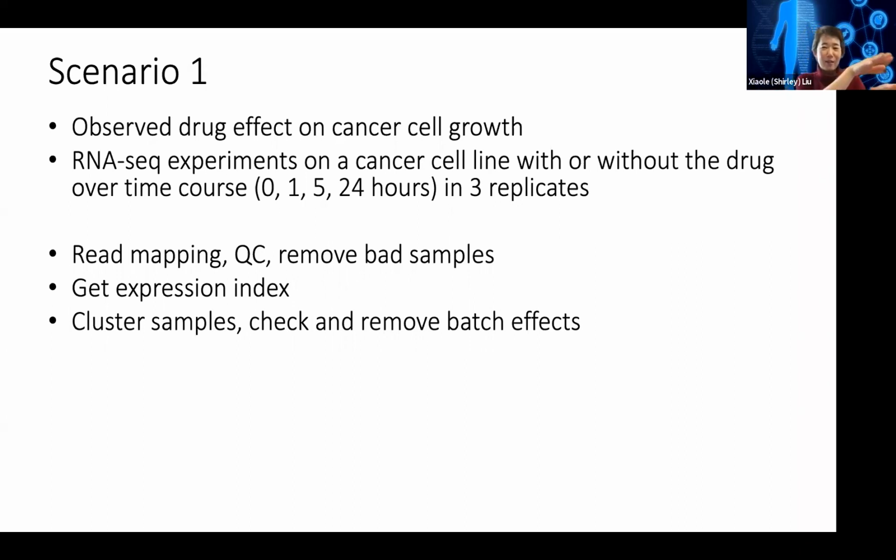Ideally the 3 no treatment samples are together, and each time point is together. But if that's not what you see, and you clearly see the 3 days as being the major variable, you might want to remove that batch effect. And then you want to try the clustering again to double check your batch effect.